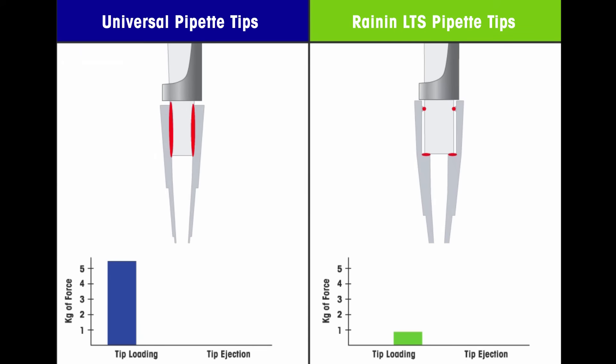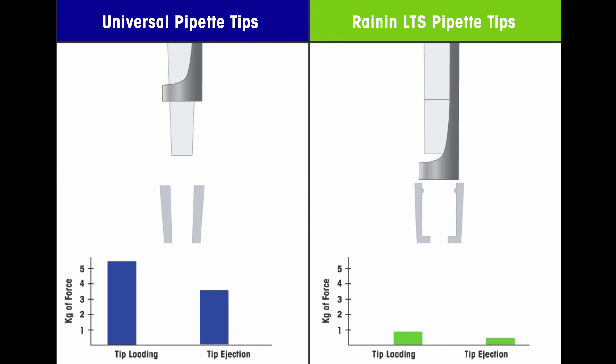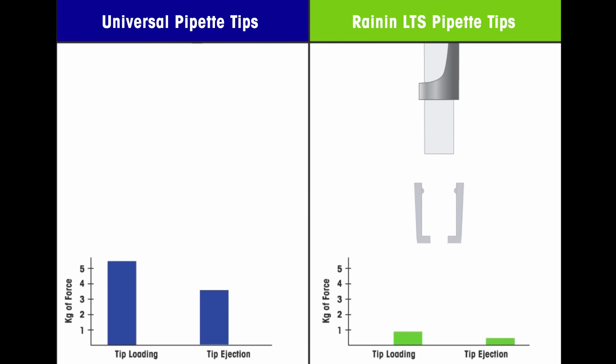Ejecting traditional tips requires pressing down with the same high force that was used to load. Ejecting an LTS tip is almost effortless. High eject forces on traditional pipettes are the leading cause, over time, of painful and expensive repetitive strain injuries.